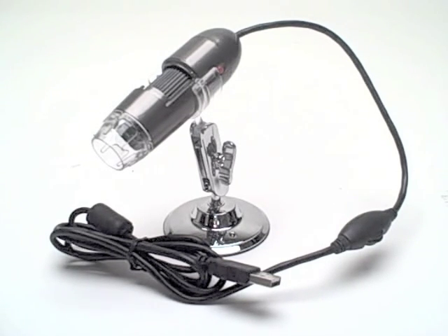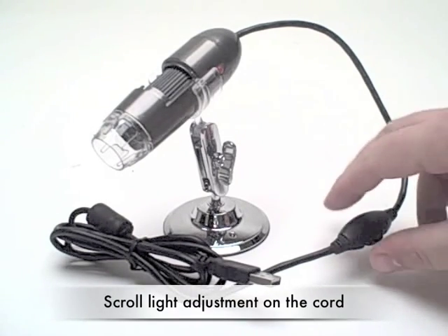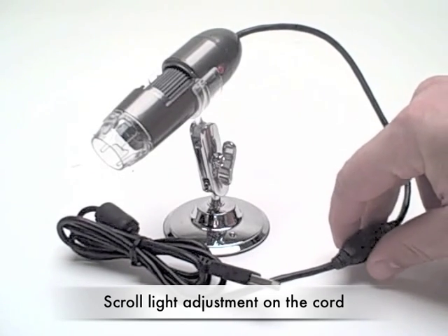Two new features in the upgraded microscope include software to make it Windows 7 compatible both in 32-bit and 64-bit applications. There's also a new light adjustment feature on the cord itself.